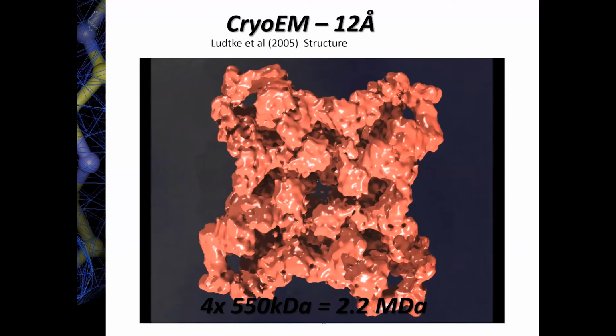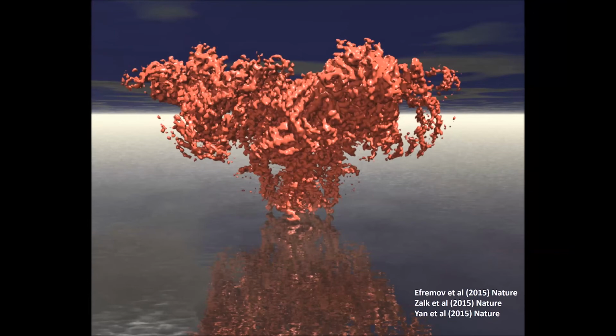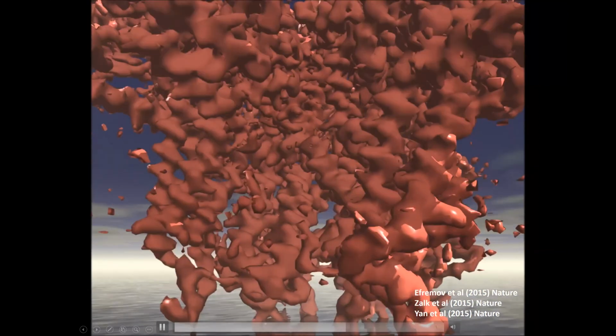Now, at that time, before major developments in cryo-EM, we were actually trying to peer into the details of this protein by solving crystal structures of various bits and pieces. And so this here shows an overview of various crystal structures available that are shown by different colors. And we could dock these into the cryo-EM maps. But of course, technology has changed a lot, and there is now a very good cryo-EM available. And so essentially since early 2015, a couple of high resolution cryo-EM structures were published back to back, and allows us to really look at RyRs in a lot more detail.